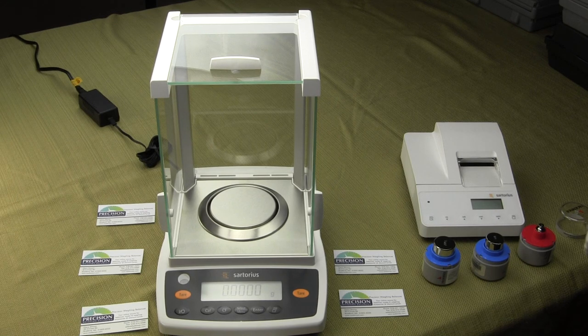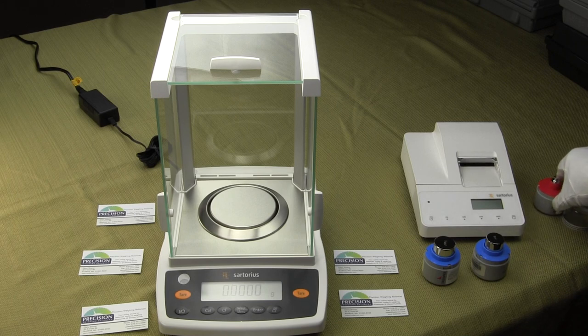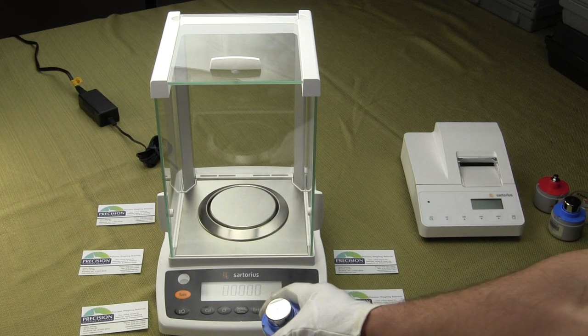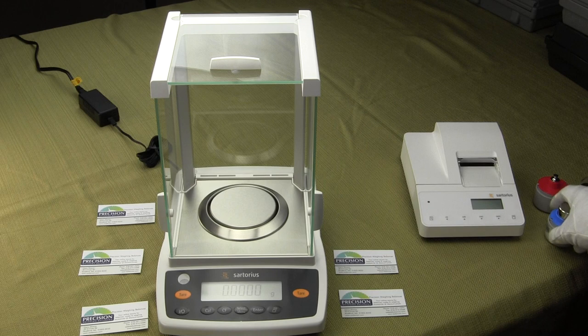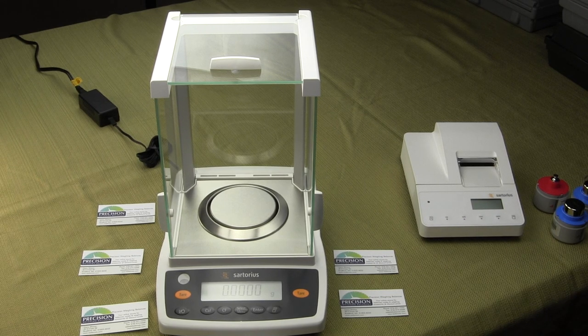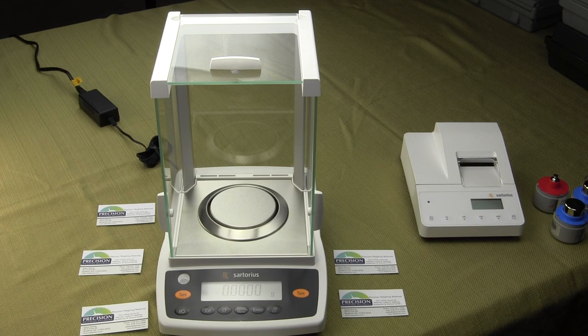Other options - calibration weights are highly recommended. This particular model, the Entris series, requires a 200 gram calibration weight. If you review the specifications on our website, we specify exactly what calibration weight is required for each balance.